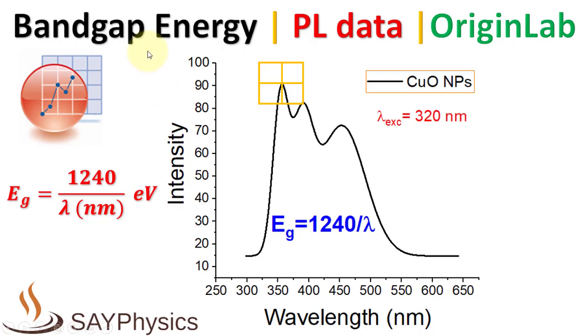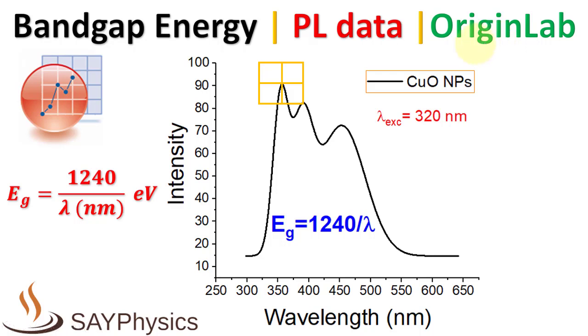In this video, we will discuss how to calculate the bandgap energy from photoluminescence excitation and emission data using OriginLab. These calculations will be compared with the bandgap value obtained from UV-Vis data.